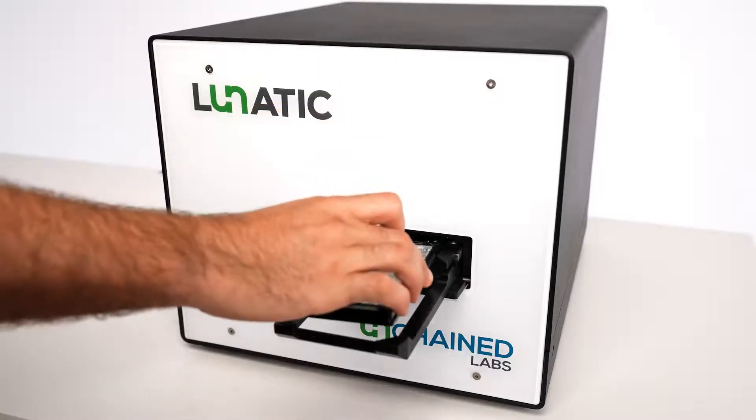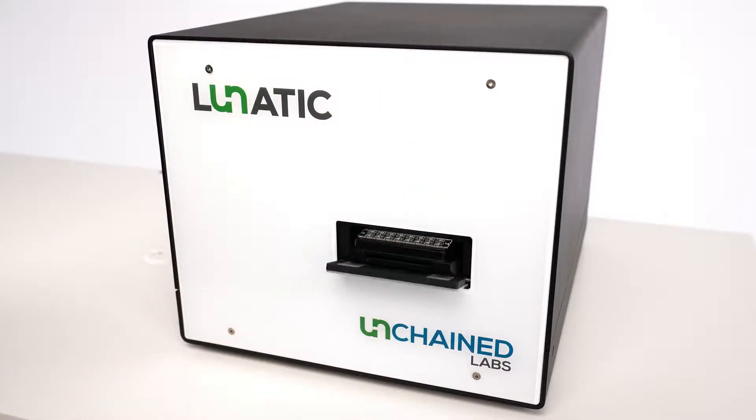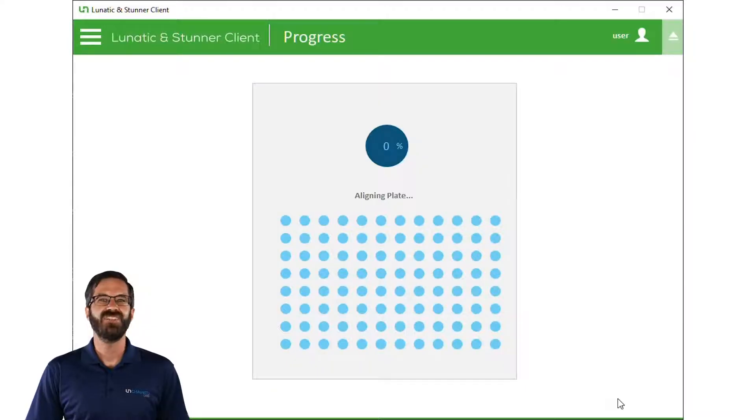With one last review screen, we're ready to load the plate and start the experiment. And if you are using any kind of liquid handler or lab automation, this entire process can be handled by our fully functional API.